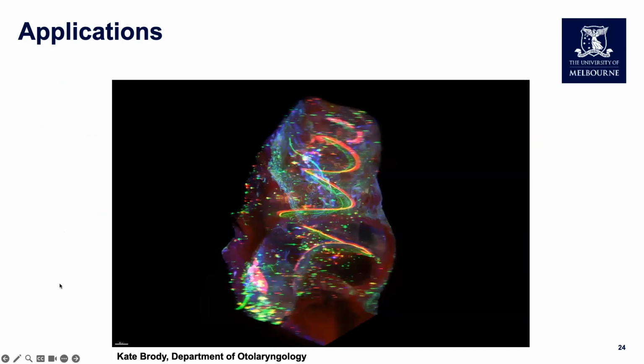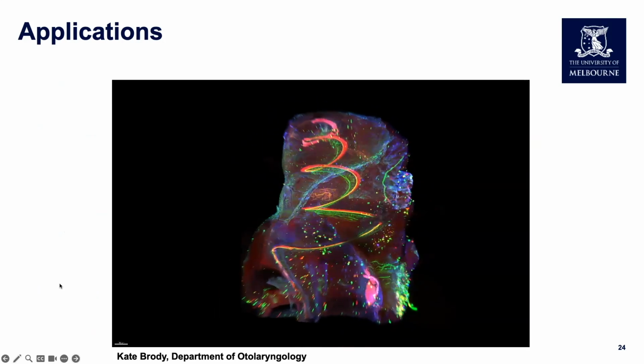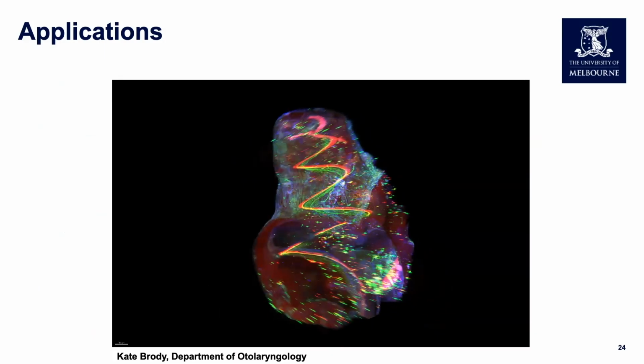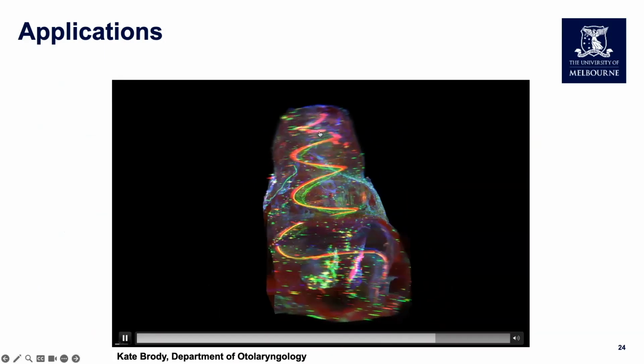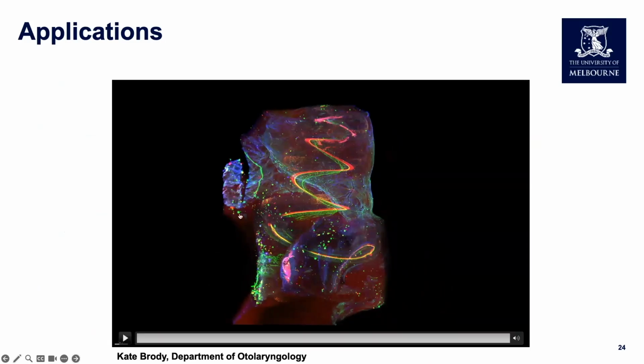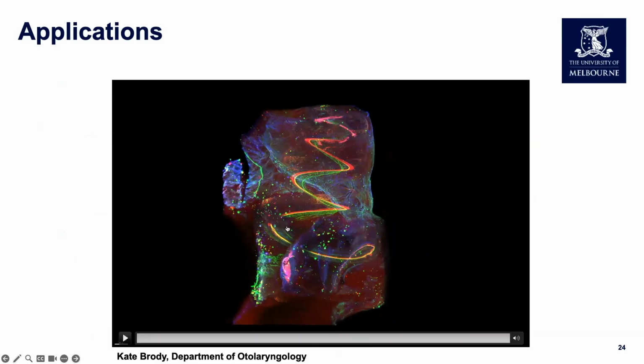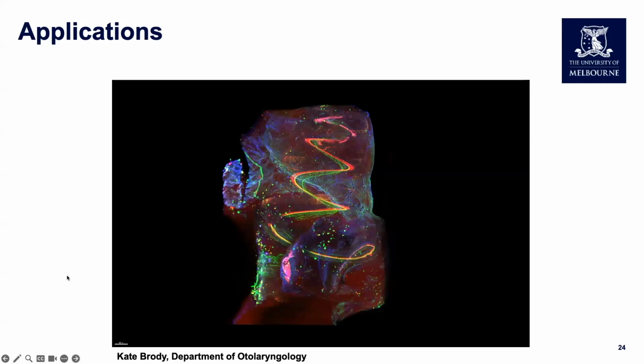This is a guinea pig cochlea, which has been chemically cleared. That process takes about 3 weeks because this is primarily made up of bone, so decalcification is quite a long step. Here we can see the spiral within the cochlea. This group is looking at cochlear implants and at regions of damage caused by cochlear implants, to see if they can improve the outcomes of those surgeries.